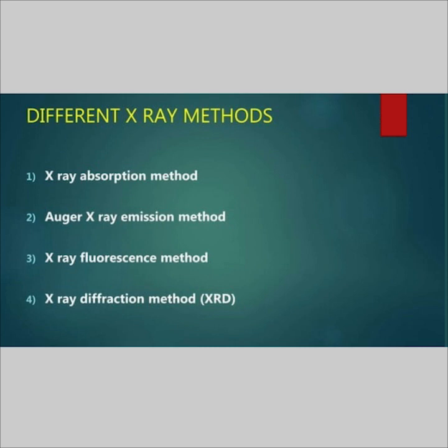Now, why are crystals used? When the sample is present in liquid form, the bond angle keeps changing. So the position of the atoms keeps changing every moment, and it is very hard to determine the structure of that sample. So when we change a biological liquid sample into crystalline form, or we can say solid form, the conformation of the molecule is fixed in a single place. So it makes it easy to determine the structure of that crystal.